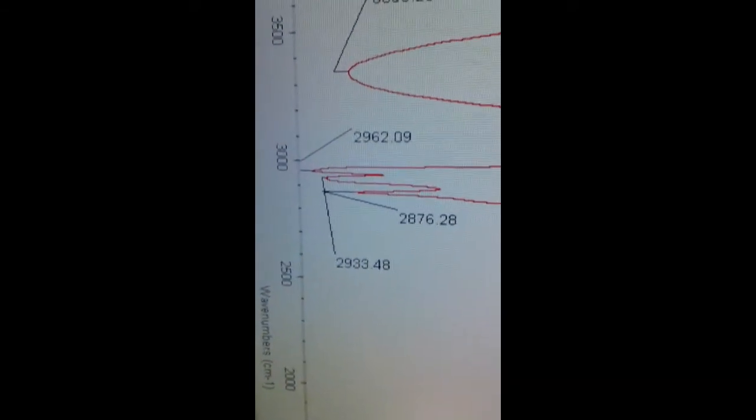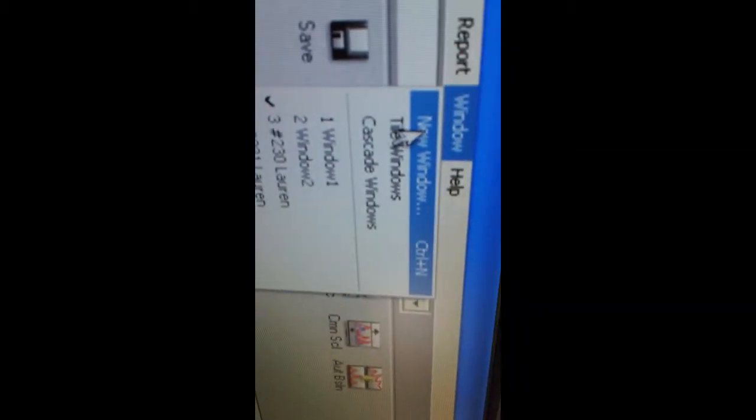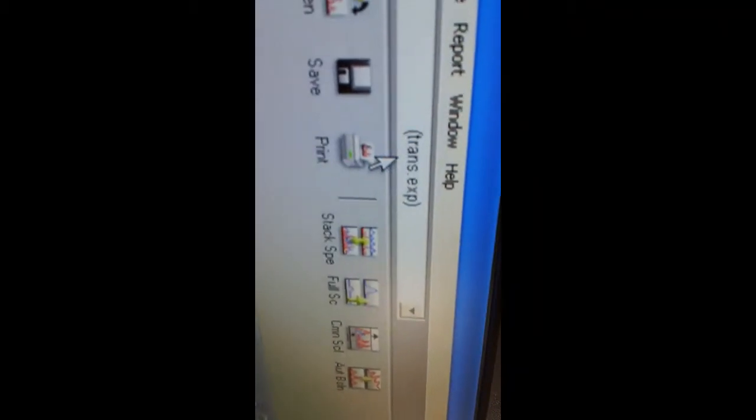It's starting from Window, click a new window. Oh my god, new window, new window. We do that, okay. Oh my god, what is happening?